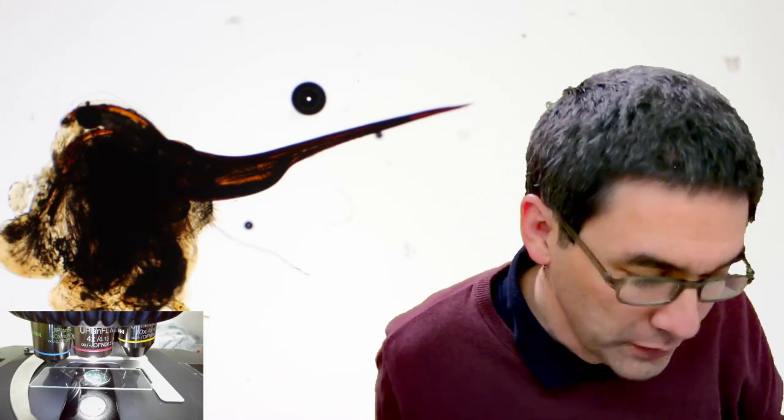Thank you. Do you mean square ones for prepared slides or just for all of them? Look, do the following for general routine use. If you just want to look at a water sample, you definitely use square slides and square cover glasses, because they're cheaper. I only got myself the round ones because they look nice for making permanent slides. But honestly, you can make permanent slides with square ones.